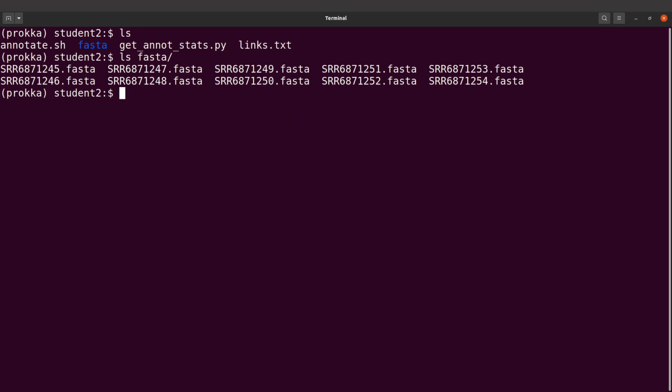Now it's time to perform the genome annotation. All right, with Prokka, you just have to specify your command. For example, Prokka, you specify the CPUs, the number, you give your kingdom, etc. But if you have multiple samples, then instead of running Prokka per sample, you can just write a bash script and add some automation, then call the bash script, specify some information, and then voila, all your genomes are going to be annotated.